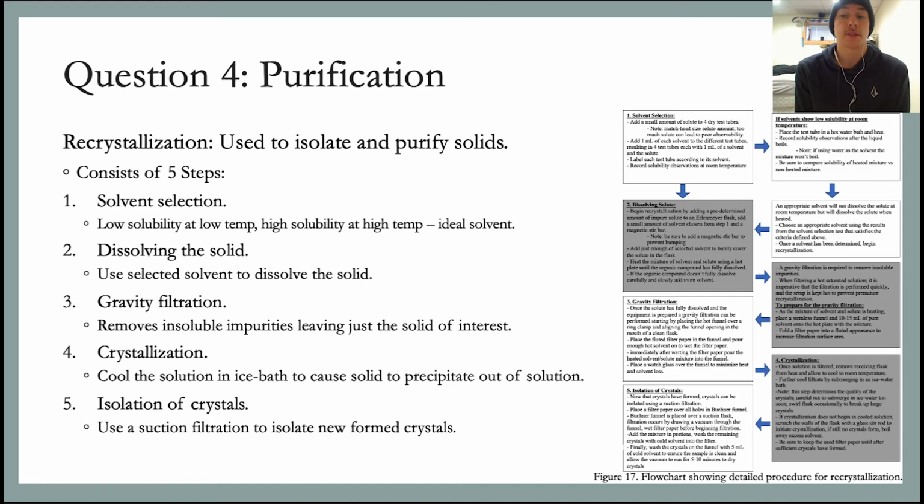Then we crystallize the solid by cooling the solution slowly and then further with an ice bath to reduce the solubility and force the solid out of the solution. Finally, we isolate the crystals using a suction filtration. The flowchart on the right is displaying the recrystallization procedure for the online lab purification and characterization of solids. I'm not going to go into it because it contains too much detail, but it is there for you to see.